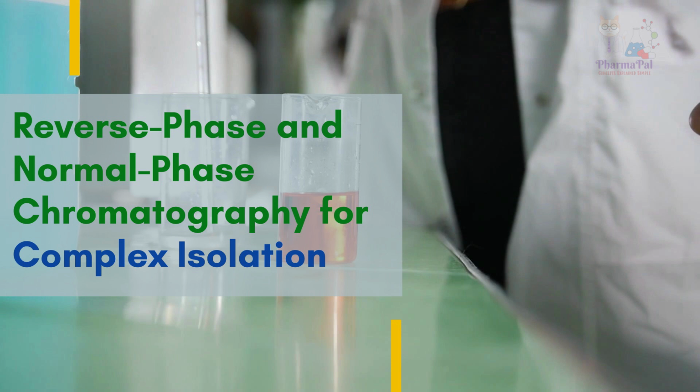And there you have it. By understanding the chemical properties of caffeine, acetaminophen, and aspirin, and using techniques like liquid-liquid extraction, pH adjustments, reverse phase chromatography, normal phase chromatography, and recrystallization, we can effectively isolate and purify these compounds from a tablet. To wrap things up, here's a quick summary.